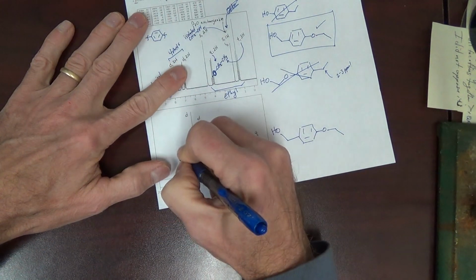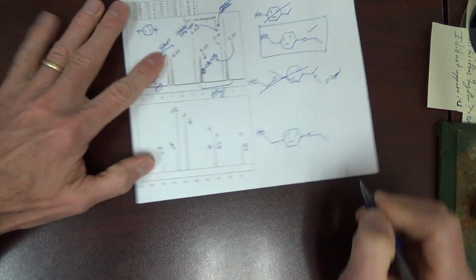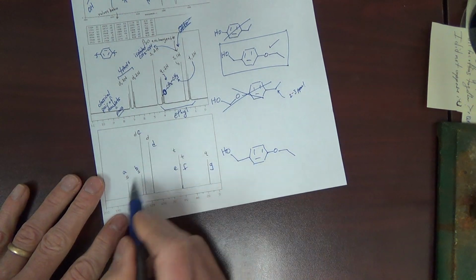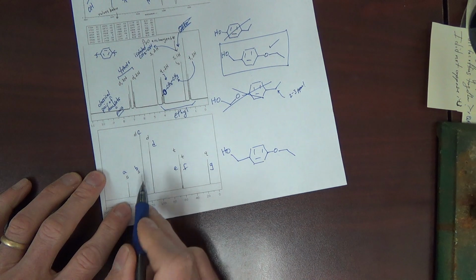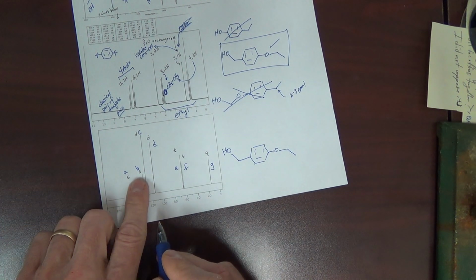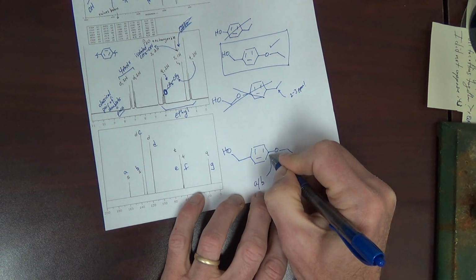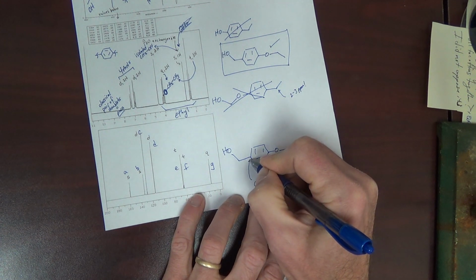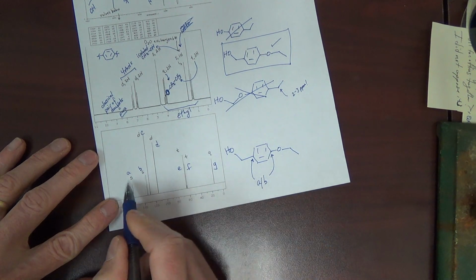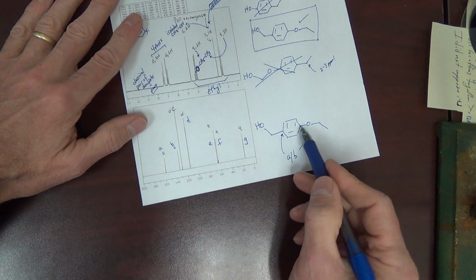I'm going to label these as A, B, C, D, E, F, and G. Okay, I'm giving you coupling here. These would be singlets if this was a coupled spectrum. These 2 are singlets. Singlets mean there's no H there. There would be no splitting with coupling. Those are also short peaks. Okay, and that makes sense too.